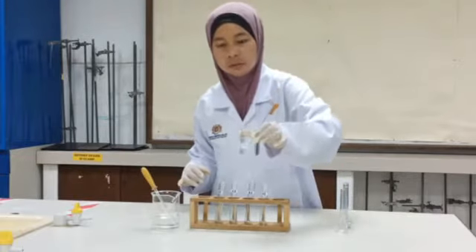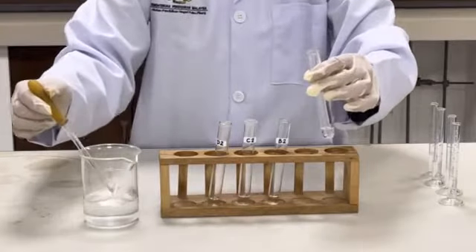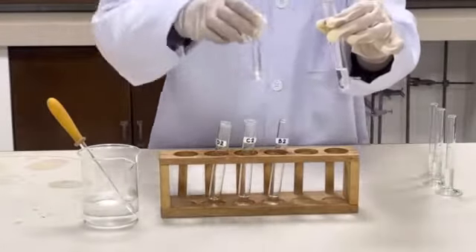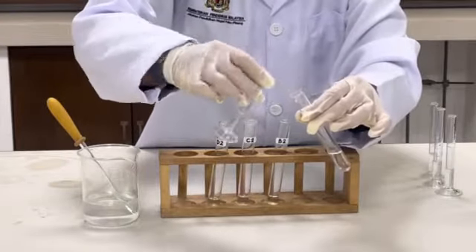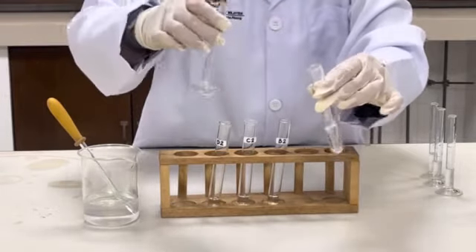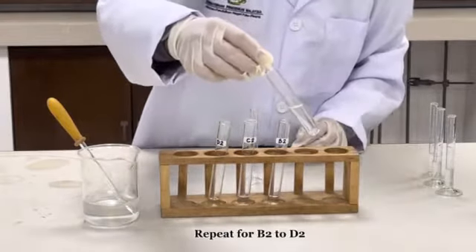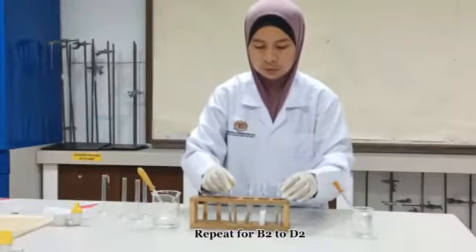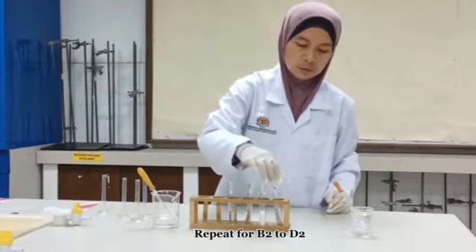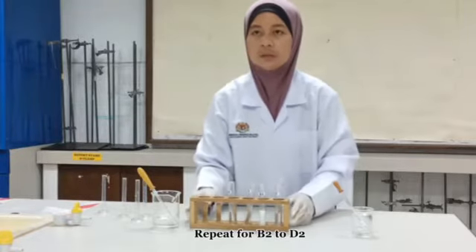We add excess nitric acid, and then we add 2 cm³ of silver nitrate. You will see effervescence only occurs in salt A. For the chloride test, only B2 has a white precipitate. For salt A we have effervescence, and for C and D there are no changes.